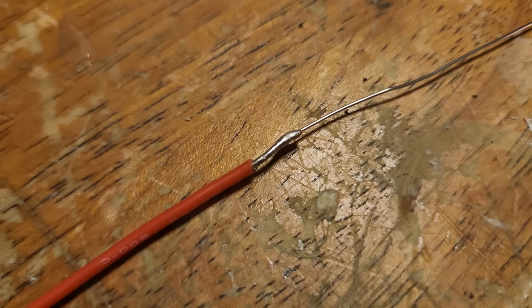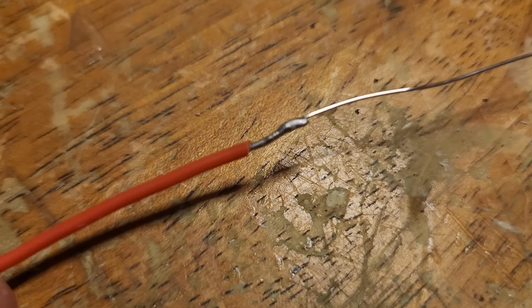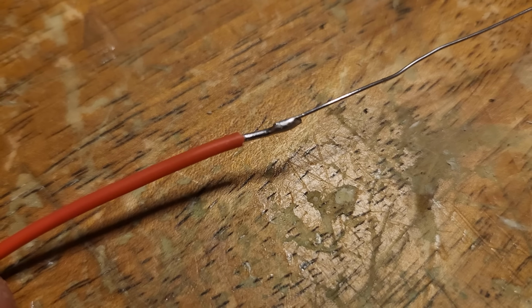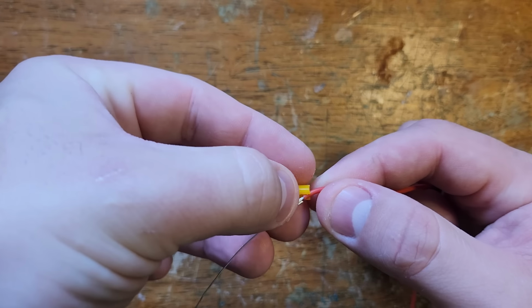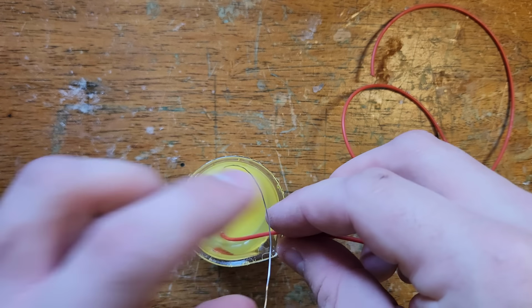The platinum anode is soldered to some ordinary insulated copper wire, but I'm concerned about what nasty chemical reactions might occur at this joint, so I placed a little ABS block over it, then used a slurry of ABS scraps dissolved in acetone to cover up the joint and seal it off.